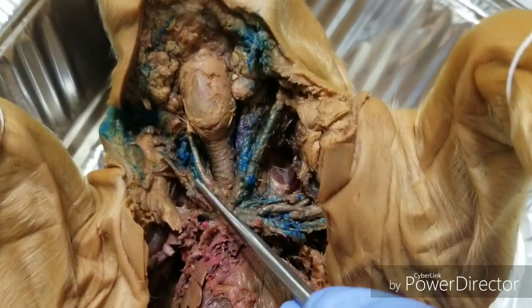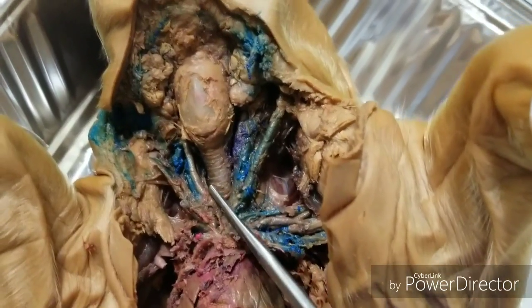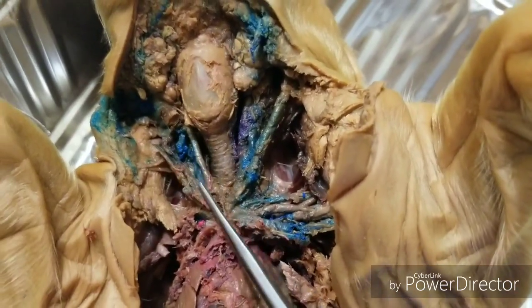And then of course the common carotid artery did help me find the internal jugulars. Even though I don't have the common carotid on this side, it did help me figure out that this is the jugular. And that was my video of my dissected pig. I hope you found it very informational as we went over the listed veins as well as 4 structures of my choosing, which I hope also gave more insight on how to orient yourself when looking at an unfamiliar dissection. Thank you very much.